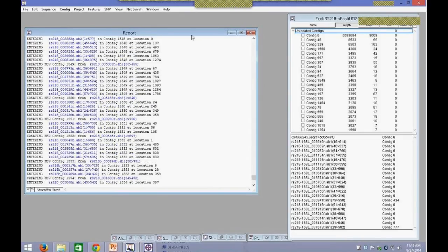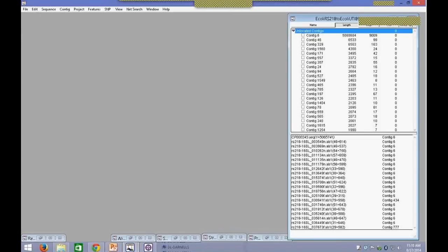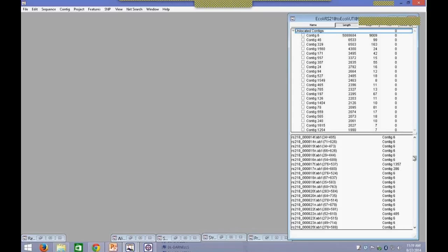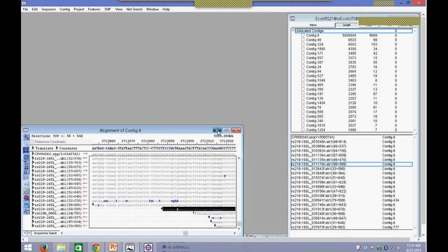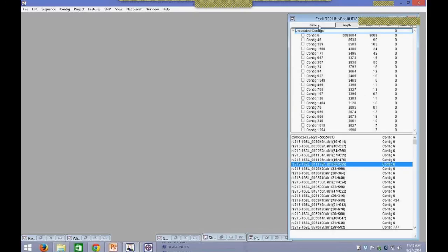This is just an overall summary of your assembly. You would then want to focus on the Contig window, which will have a list of all the contigs formed out of your assembly. On the bottom, you will see a list of all the reads that went into each of the contigs and the corresponding contig number to your right. You can easily browse through this. If there's a specific read you're interested in looking at, you can double-click on it and it will jump to that location in the alignment view.